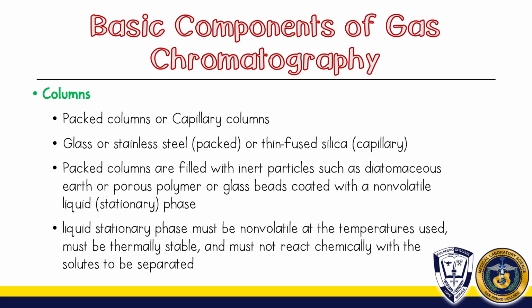And the liquid stationary phase must be non-volatile at the temperatures used. It would be useless if your stationary phase were also volatile. So it must be thermally stable and must not react chemically with the solutes to be separated. If it reacts, then we may make mistakes in detecting which certain substance is present.